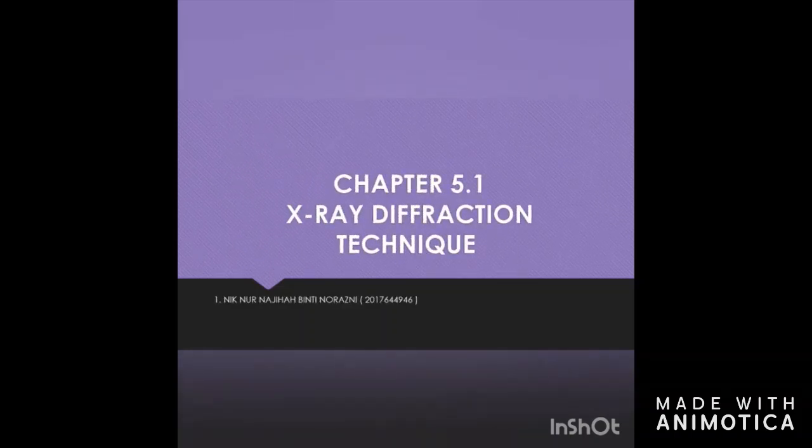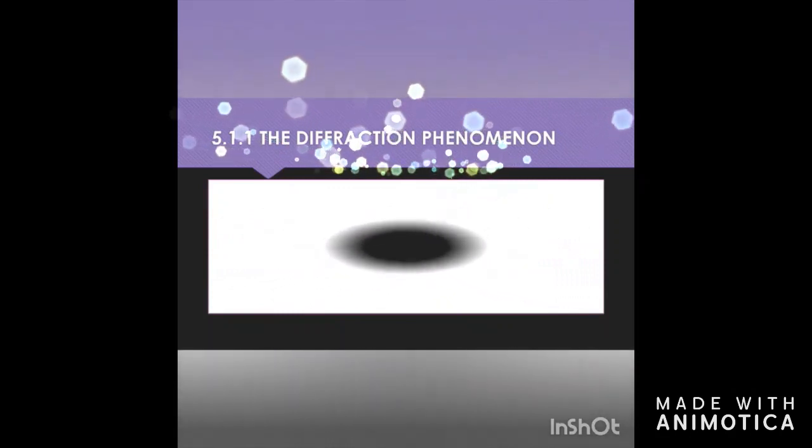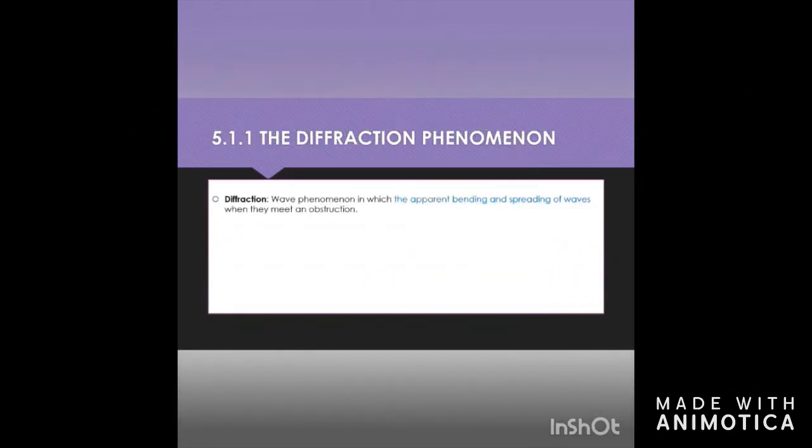Chapter 5.1: X-ray diffraction technique. The diffraction phenomenon. What is diffraction? Diffraction is a wave phenomenon in which there is an apparent bending and spreading of waves when they meet an obstruction.